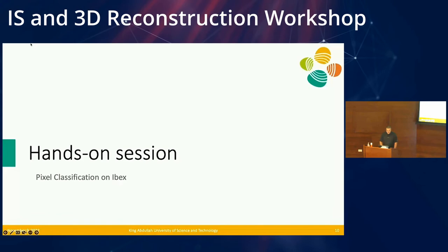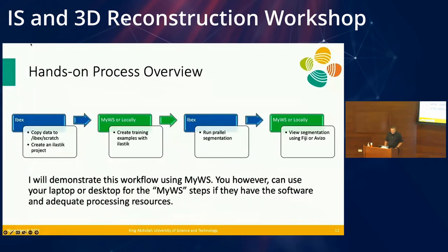All right, let's move on to the hands-on session. Our hands-on session today is going to be composed of four primary parts. Each one you can see here. We're going to start on IBEX, and then you can do the second step on the IT remote workstations, or you can do it locally if you have all the software installed on your local system. We'll go back to IBEX, and then we'll come back to the IT remote workstations.